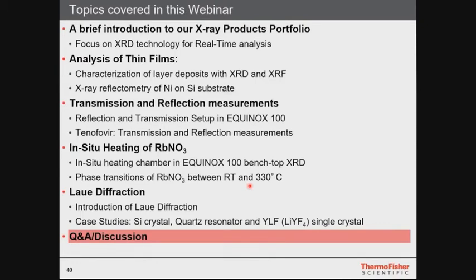So if you, for example, have K-alpha and K-beta radiation, you get 3 different sets of signals, which will make it tough to evaluate the data, even if there are many reflections. So you want to reduce this number. You can use a filter, but then you get artifacts of the absorption edges of the material which is used as a filter, and you reduce the intensity.